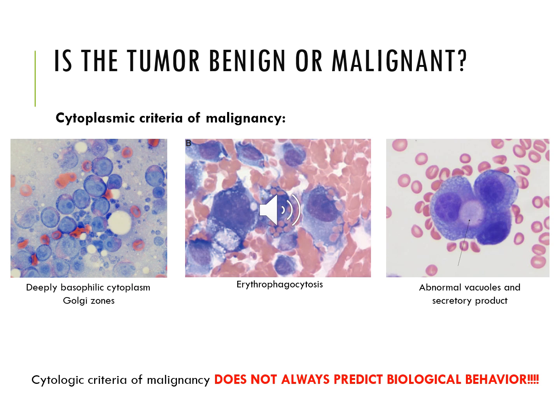This middle image here is a picture of histiocytic sarcoma. These are round to spindle in appearance. They're very large, and they have multiple nucleoli in that nucleus there, which is not good. And there's marked anisocytosis and anisokaryosis, and it's just bad. But something else that we see here is erythrophagocytosis.